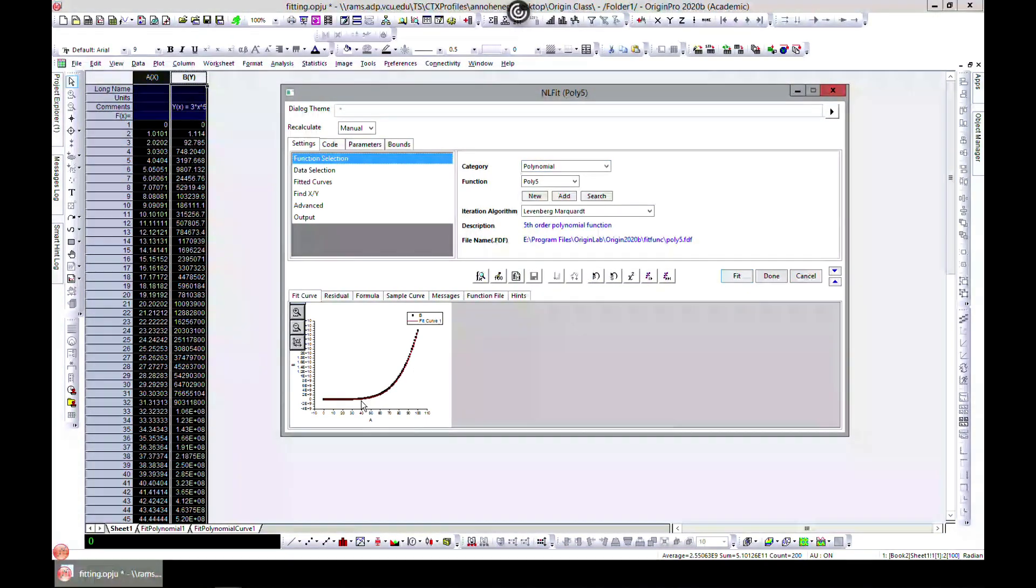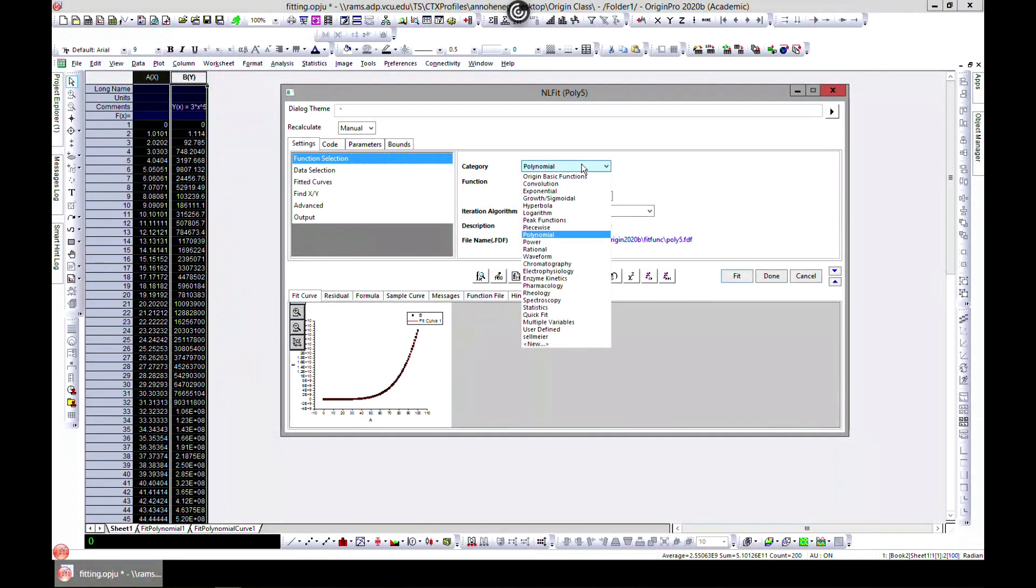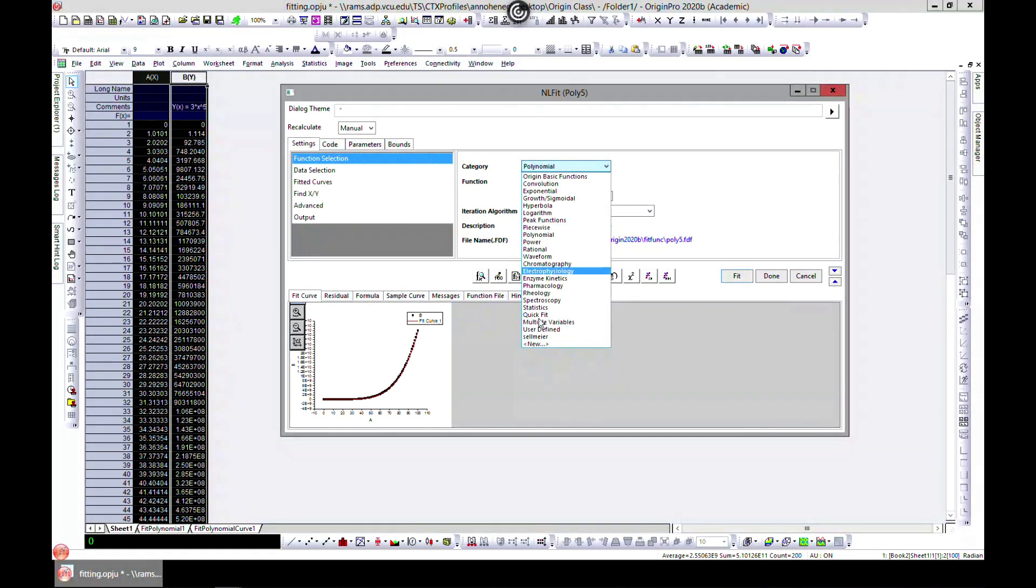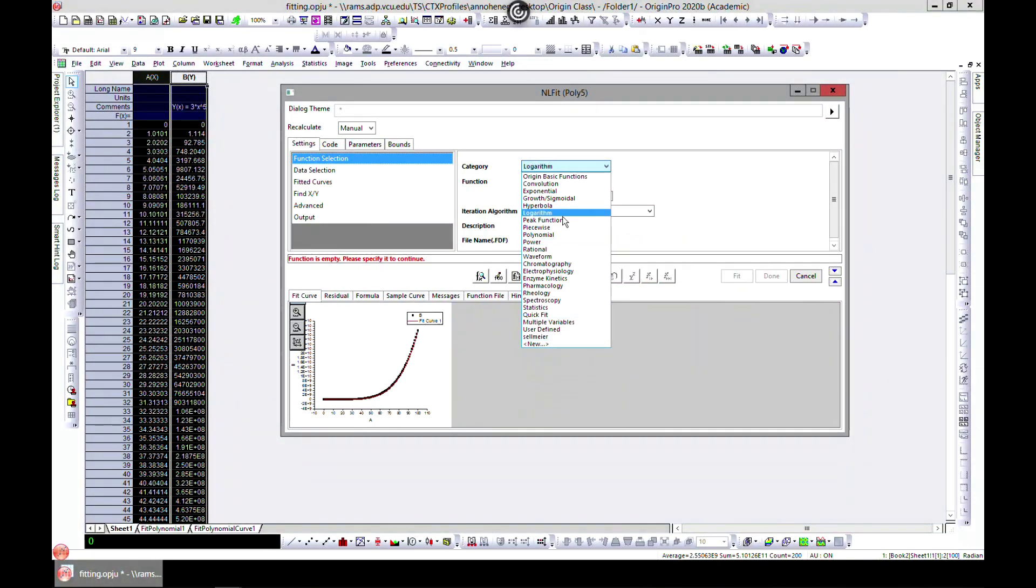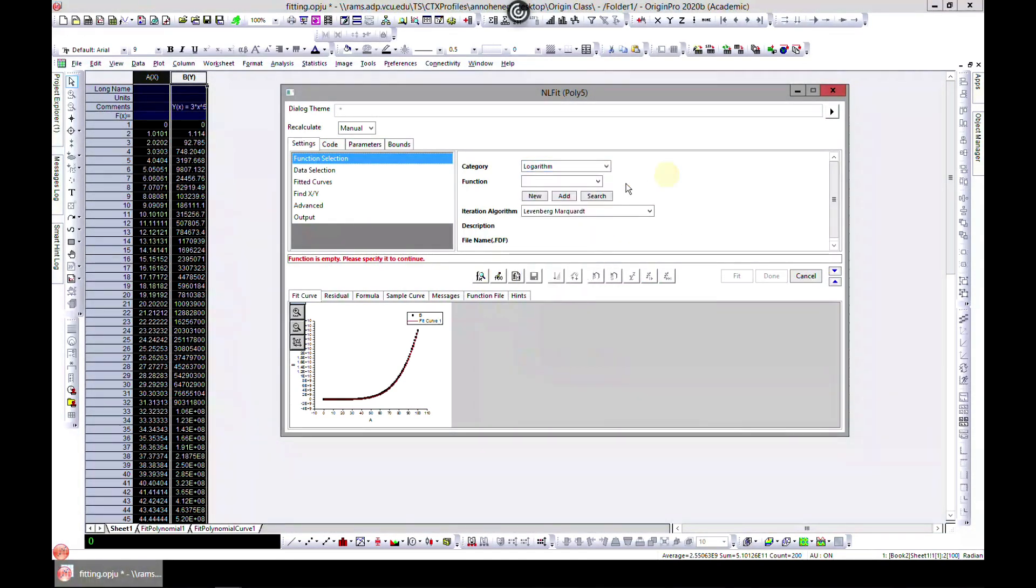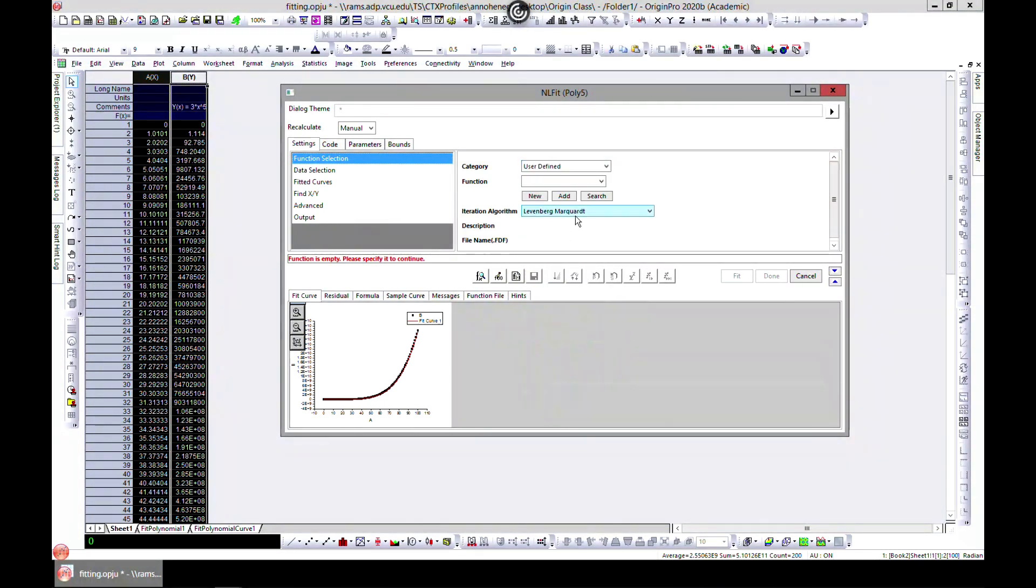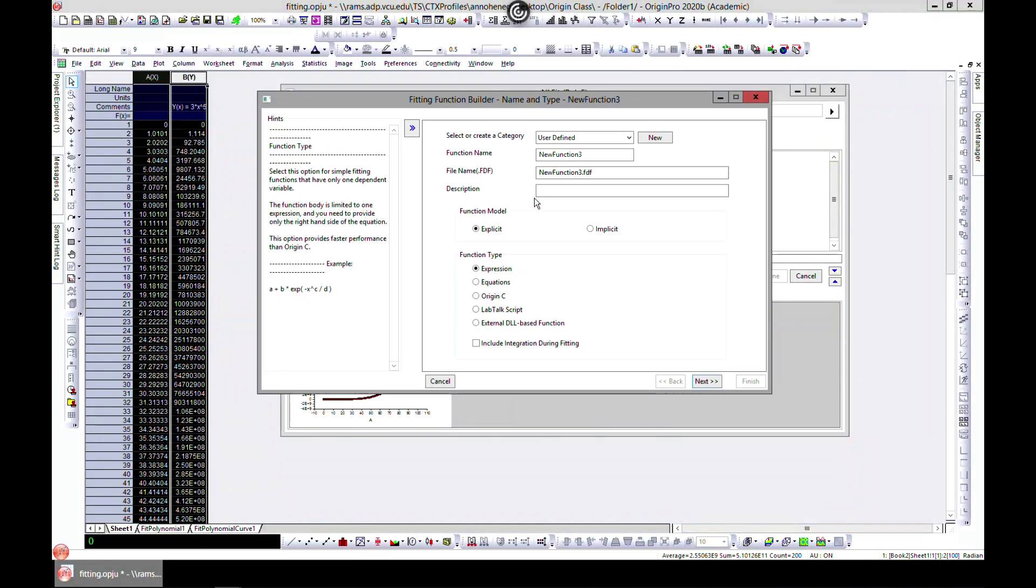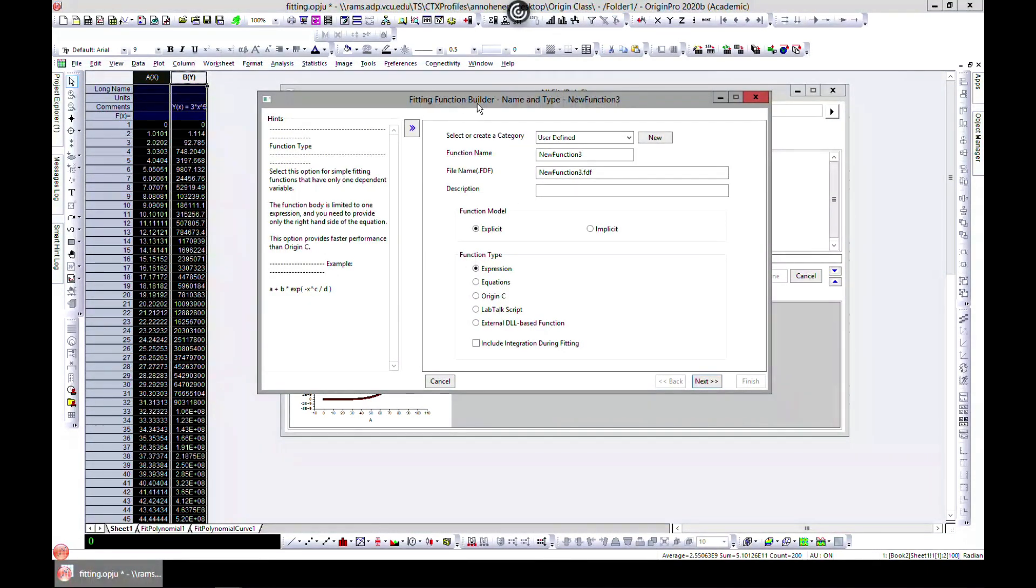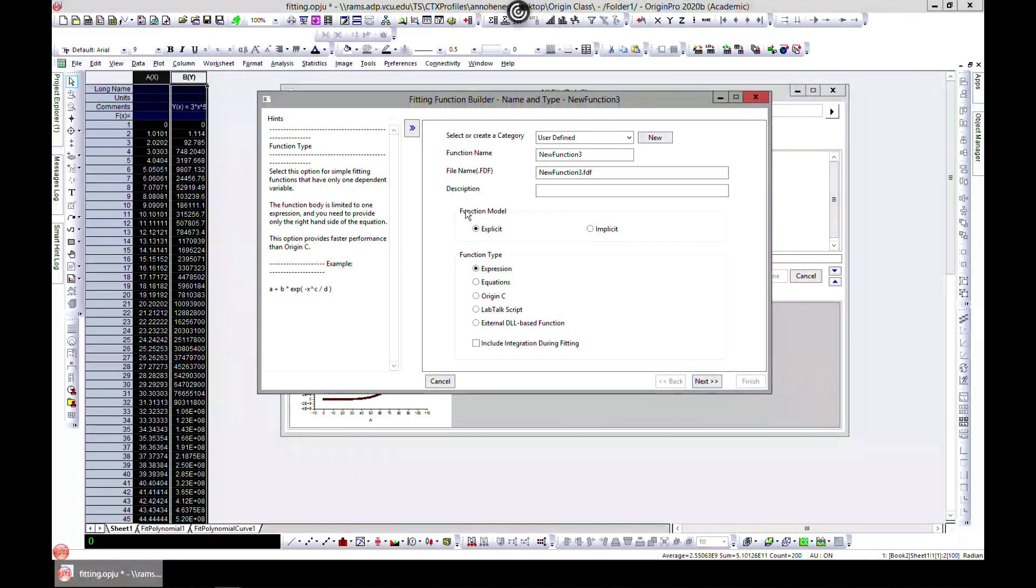Maybe your equation or model is not found here and you want to create one yourself. If you want to create your own function, come over to User Defined and head over to New. This brings up the Fitting Function Builder, which will help you build your own function.